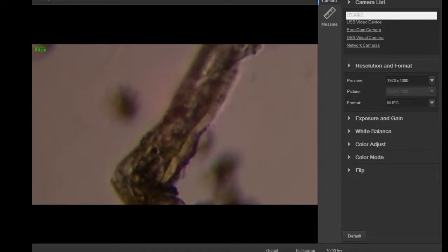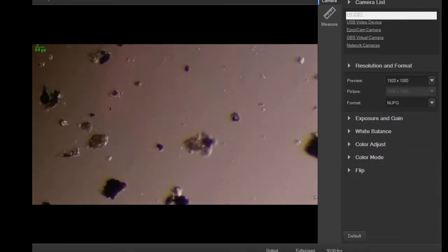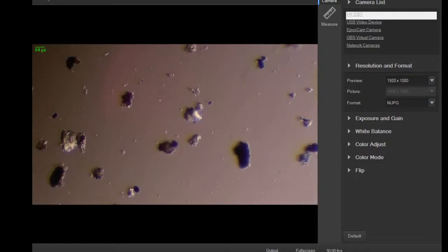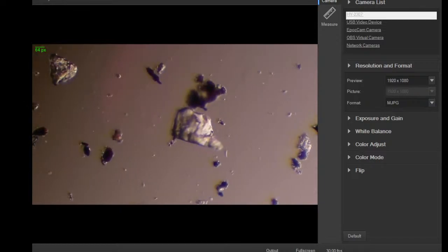Alright. So that was one guy. That wasn't a total loss. Let me go to some lower power and search around the rest of this slide before it starts to dry up. Any more movement? Lots of colored bits, little pieces of plant debris, crystals. Here's some cool looking crystally bits from something.